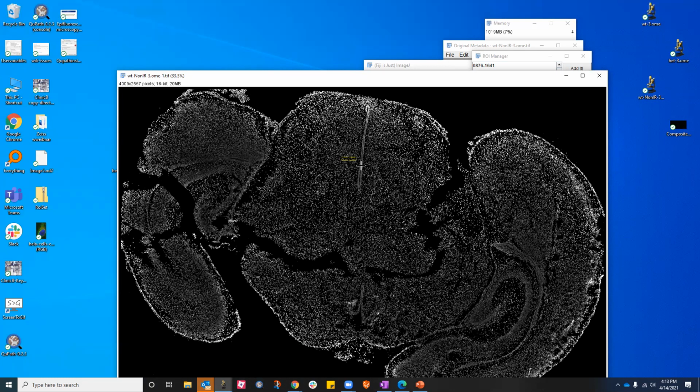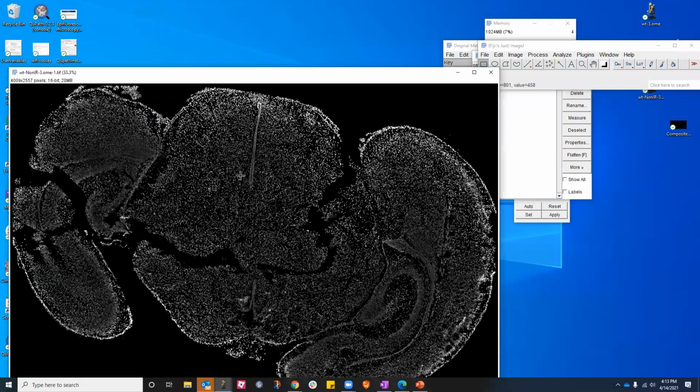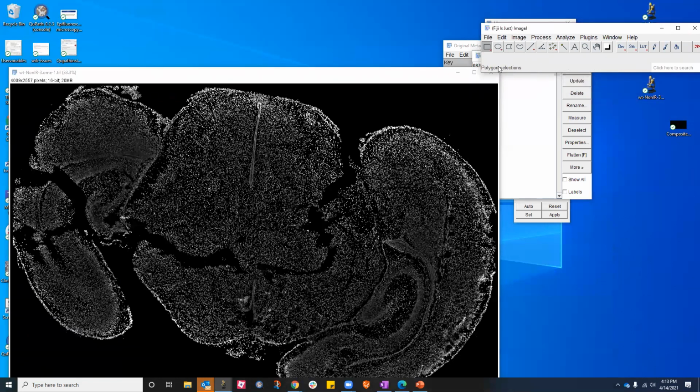And the same thing is true. You can select this, and then you can duplicate the same area for a multi-channel image and whatnot, right? So this ROI feature really becomes very helpful at that kind of an area. So, also, let's say if you want to select the same size of the ROI for everything, right? You can look at the size of the ROI that you are doing, right? So right here, it will tell you what is the X and Y or the width and the height, right?